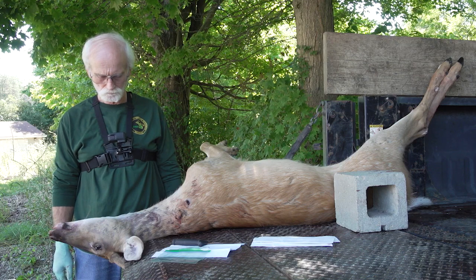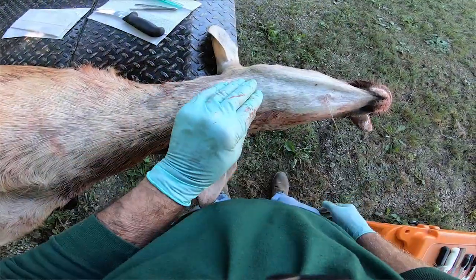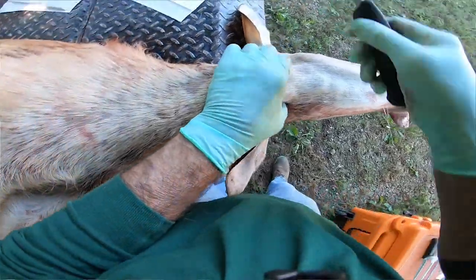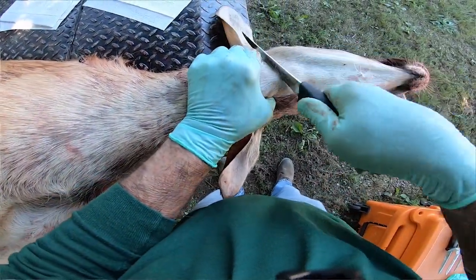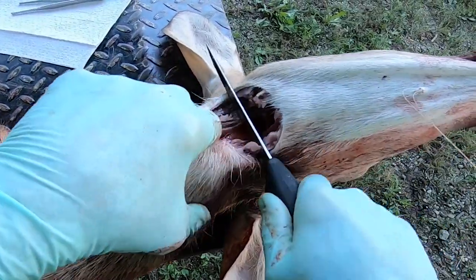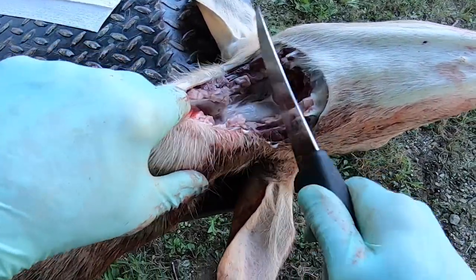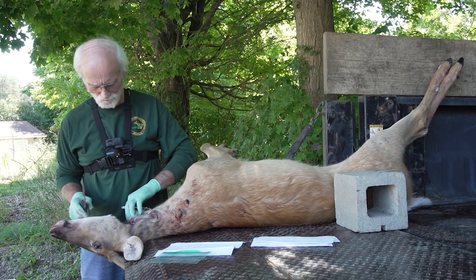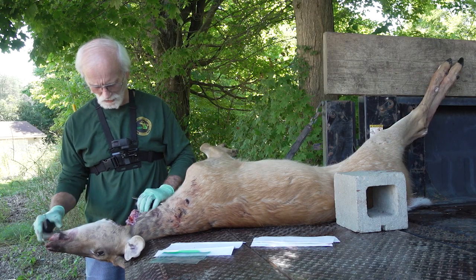With your deer positioned on its back, feel along the throat for the Adam's apple or larynx. Once you have located this, use your knife to make a semicircle cut in front of the larynx and extending along the back of the jaw bones. This cut will need to go deep through the tissue and muscle down to the spine. You may need to push the head down and pull the larynx towards the body to help open this area up.